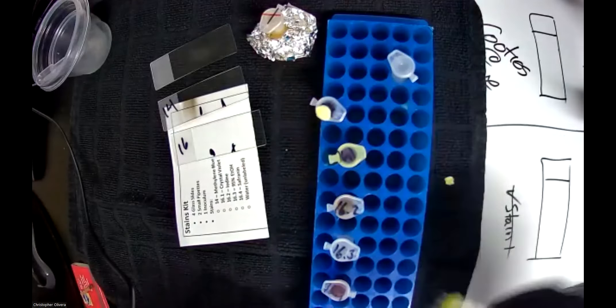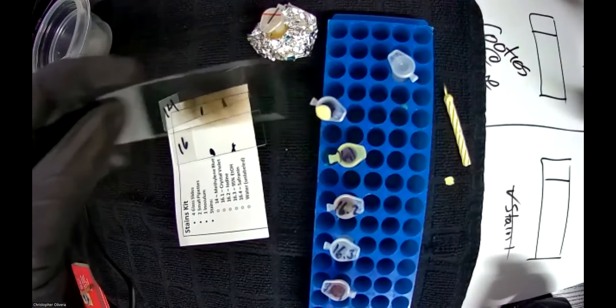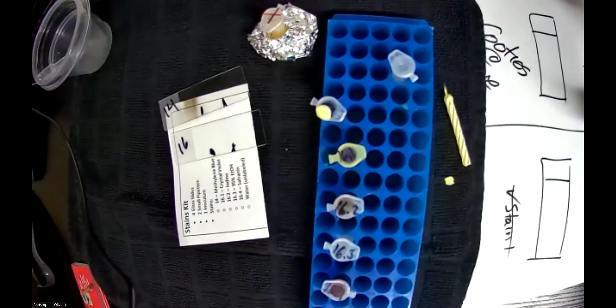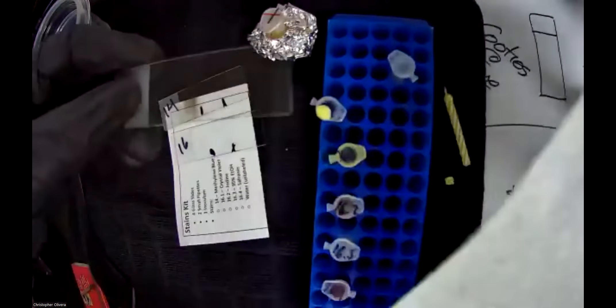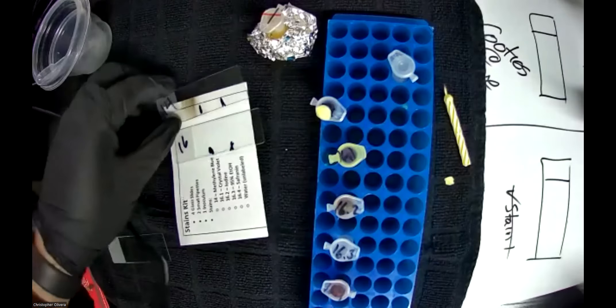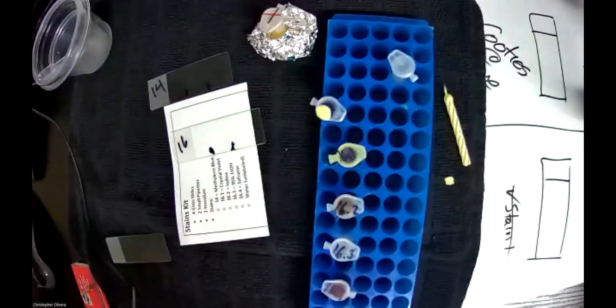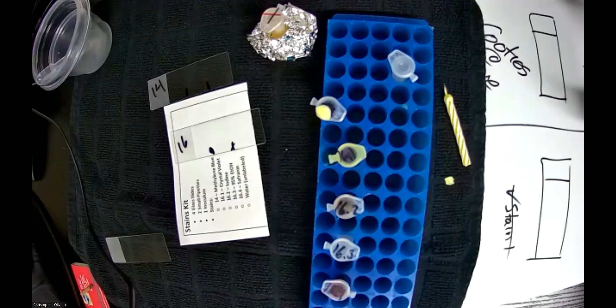Now you can see the slide is all burnt up. But the good thing is, with a paper towel it actually comes off — it's just soot. So if you happen to do an extra burn behind it, take a paper towel and it's back to normal. Alright, so let me move my slides around and do a quick stain — I'll pause for half a second and then we'll proceed.